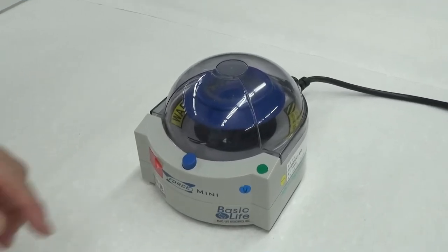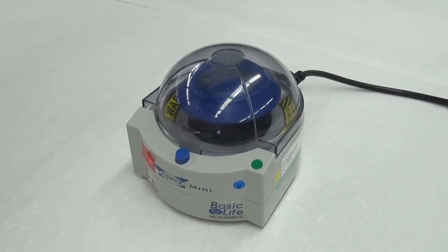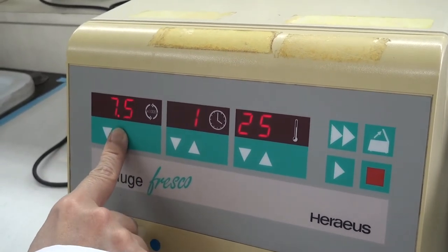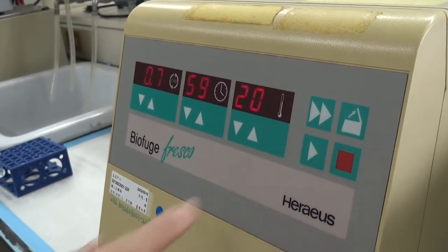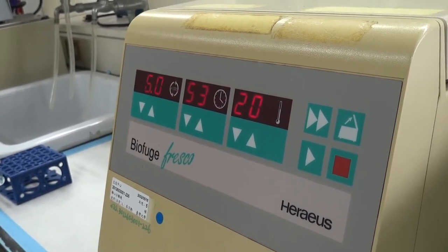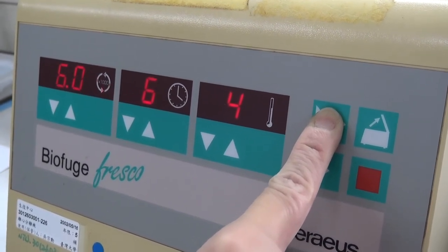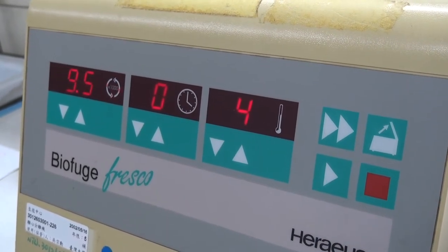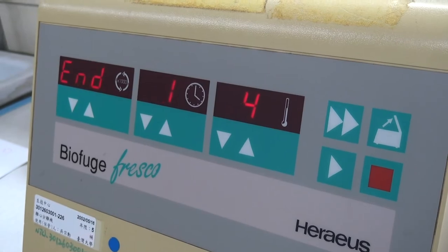Low-speed models have fixed rotation speeds and cannot be configured; the centrifugation time is controlled by the on and off of the start button. Settings for rotation speed and centrifugation time are available for high-speed centrifuges, and the start button is pressed to start centrifugation. The panel will display an increasing rotating speed and time remaining. If centrifugation for only a short time is needed, press and hold the spin-down button after setting the rotation speed. Let go of the spin-down button several seconds after the rotation speed is reached and the rotating speed will slow down to a stop.